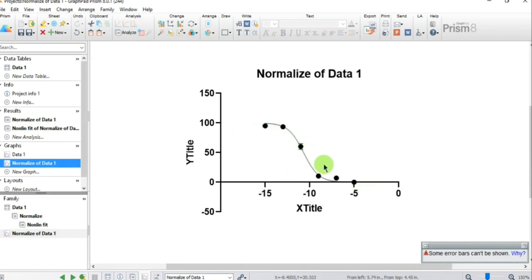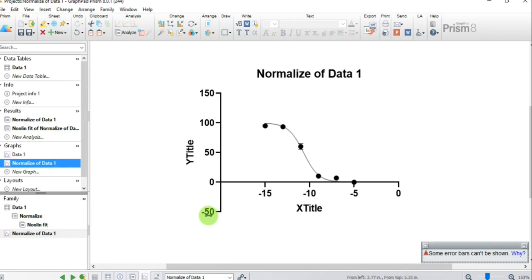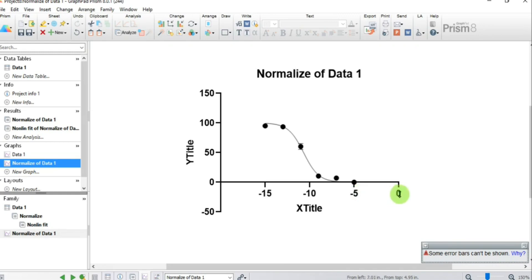We need to adjust the X-axis and Y-axis. The Y-axis is projecting downwards into negative values — we want it to start from 0. The X-axis values are also not properly arranged: my highest concentration of minus 5 is showing as 0, and my lowest was minus 15. We'll fix both axes.